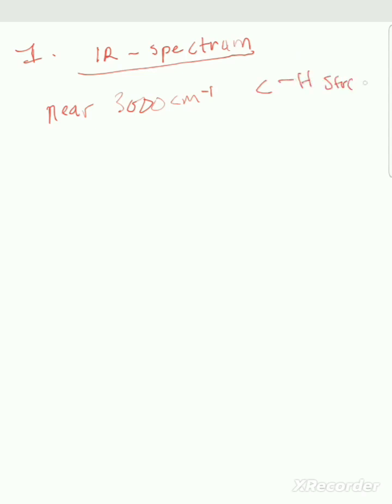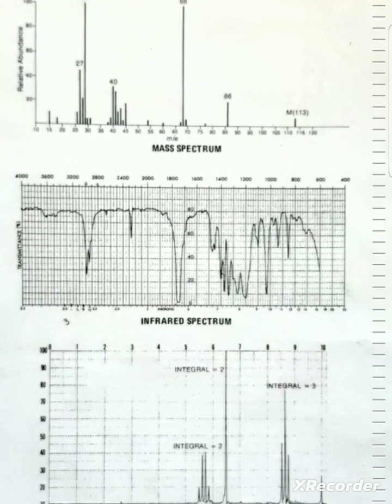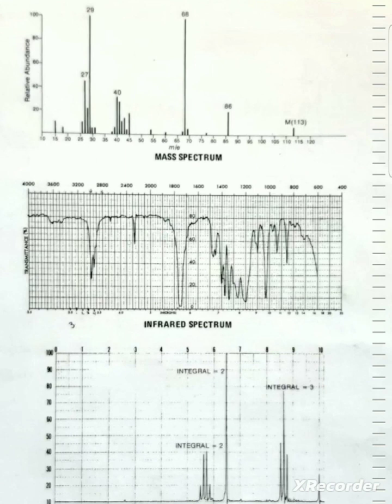So, look at the NMR, which is here. Is there any multiplet? You can't find any multiplet here. So this CH which we have is not the aromatic ring. Alright, so we go to the next one. Let me just zoom it. Okay, good.